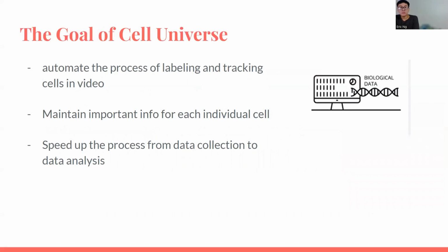And the goal of Cell Universe is really to automate the process of labeling and tracking cells in the video. That way you aren't stuck for hours or days just trying to label these videos. And we also want to maintain the important info for each individual cell, which is how they are splitting. And by using Cell Universe, this will speed up the process from data collection all the way to data analysis.